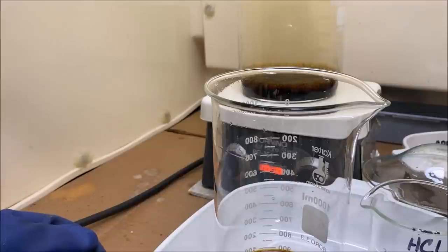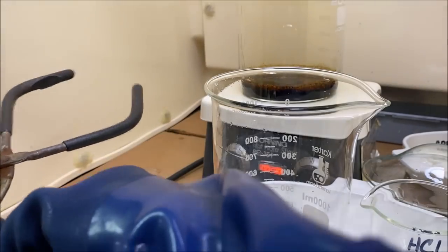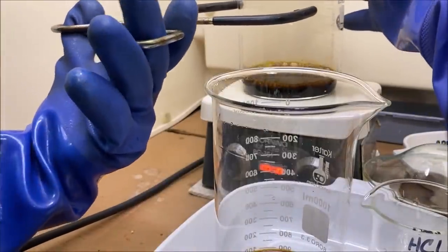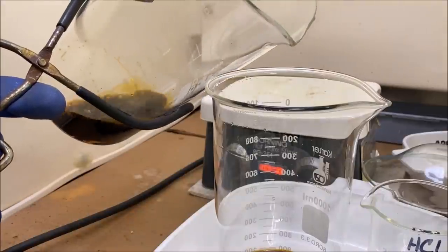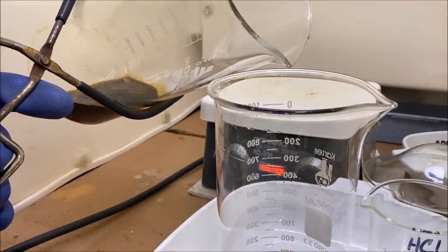What we're gonna do here is pour off this solution. I've got those thick gloves that go all the way up to my shoulders to protect my arms and hands. And refining platinum is just not suitable for a setup like I have here.